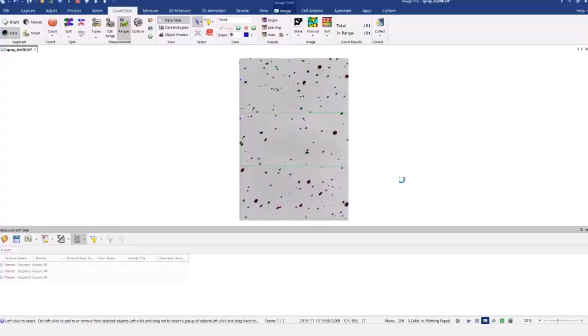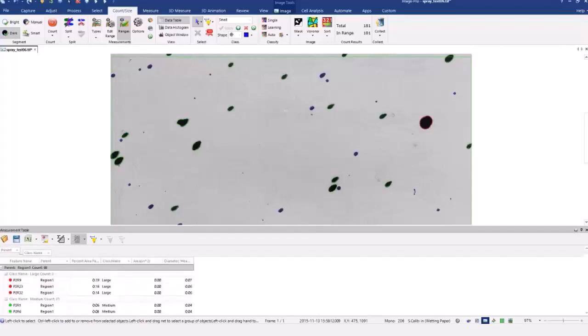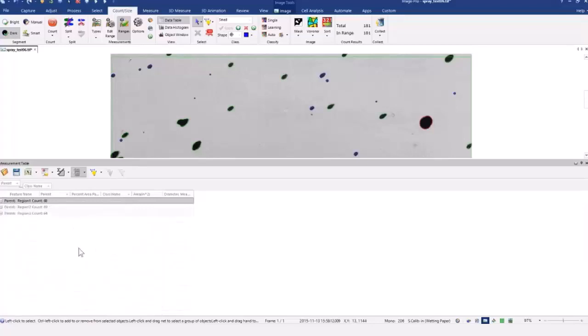When I press the OK button, you can see, if I zoom in a little bit, these are all now color-coded into my three bins. I can now further take this, and this is where I mentioned, if I bring the class name, I can drag that to here. And now I have all the data for each of my parent regions.